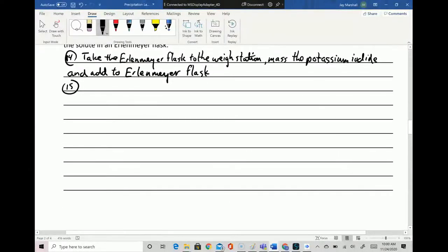Now we have to put a little bit of detail into this next part, right? How do we describe the filling of the graduated pipette? Okay, go ahead, Jonathan. Using 25 milliliter graduated pipette. I don't know what the tool on the top is called. It's just called a pipette bulb. Yeah, pipette.